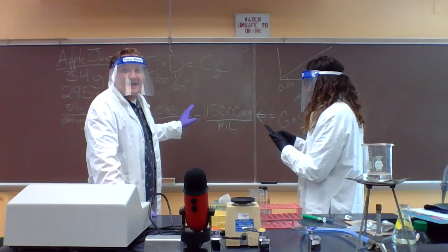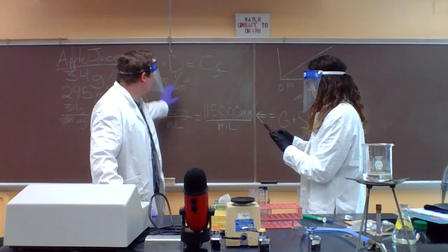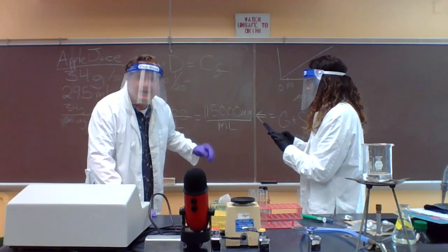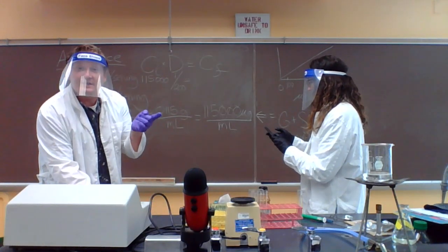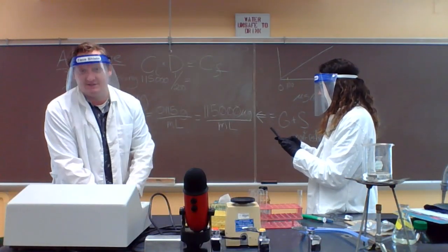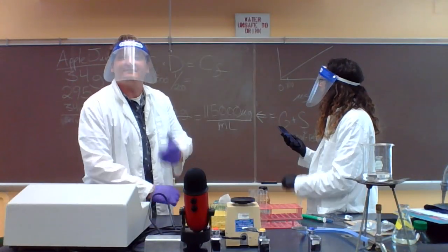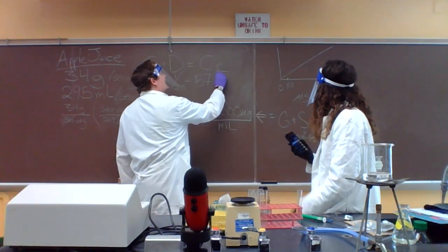So dilution factors, right? When you see this 1 in 200, it means for every 200 units of final volume, there is 1 unit of volume of your initial solution. In other words, a 1 in 200 dilution could be 1 microliter of your initial solution and 199 microliters of your diluent. Note that the units will cancel out here, meaning that a dilution factor is a unitless value. 575. 575, right in the middle. That is exactly what we want.